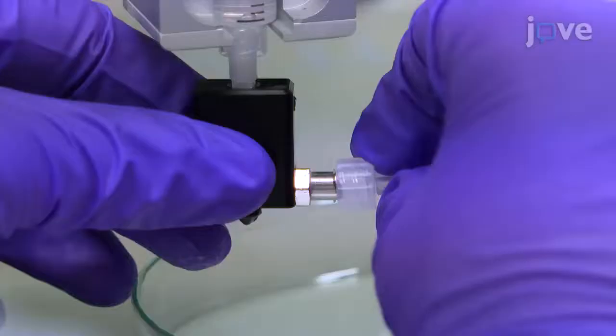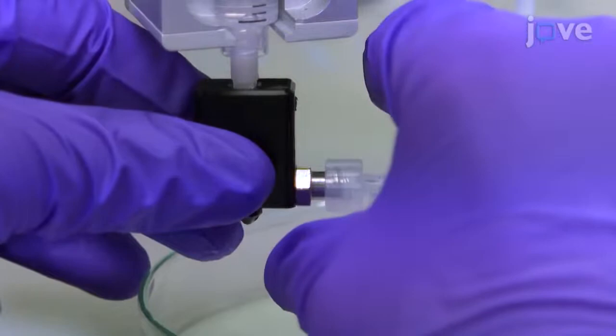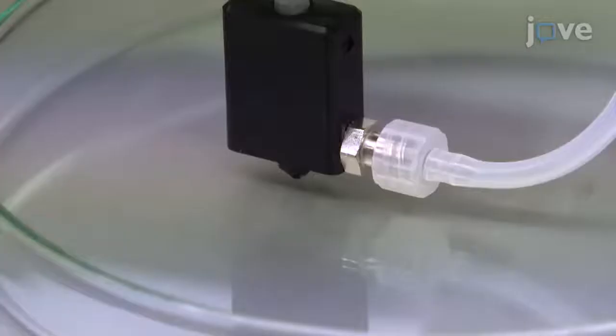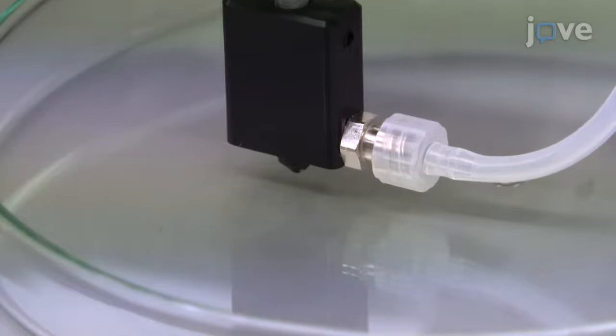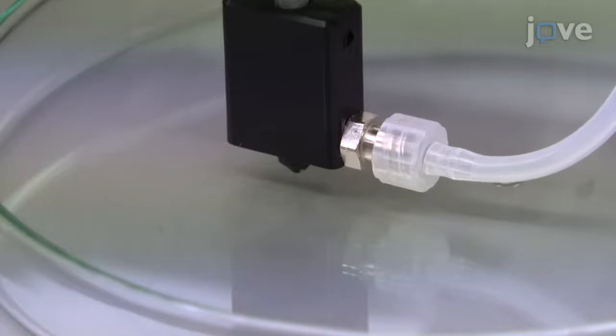Use a luer lock to connect a short tube to the side luer input of the coaxial nozzle. Carefully manually adjust the alignment until the nozzle touches the surface before retracting the nozzle to a distance equal to the outer nozzle diameter.